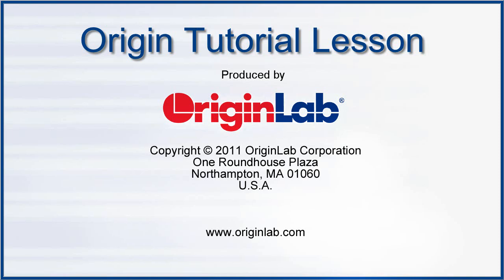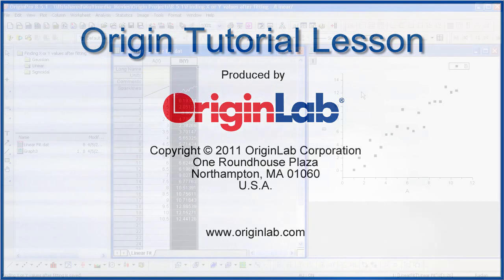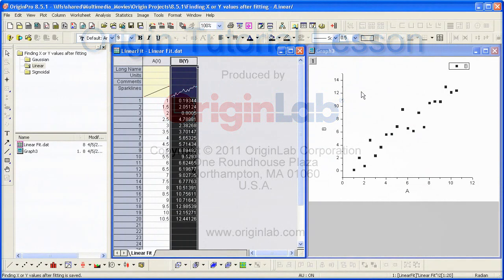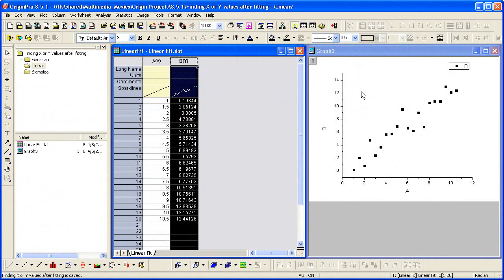In this tutorial, I will show you how after fitting your data, you can find new x or new y values from the fit curve. This feature is available for both linear as well as nonlinear regression.